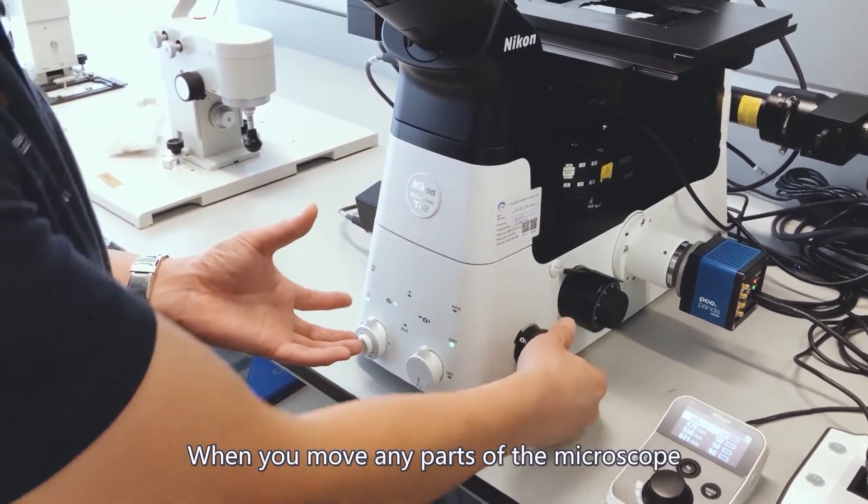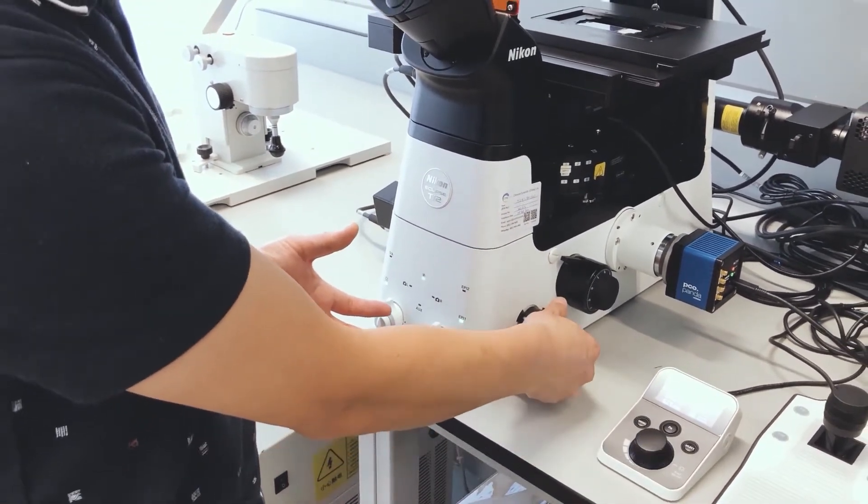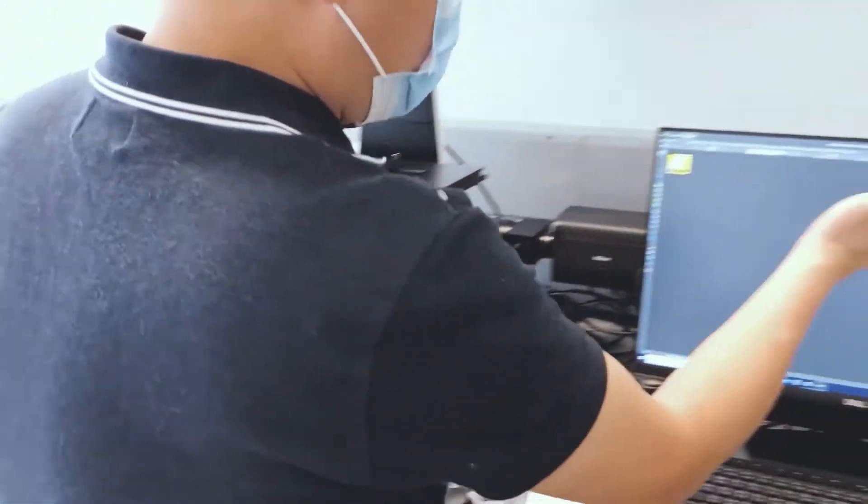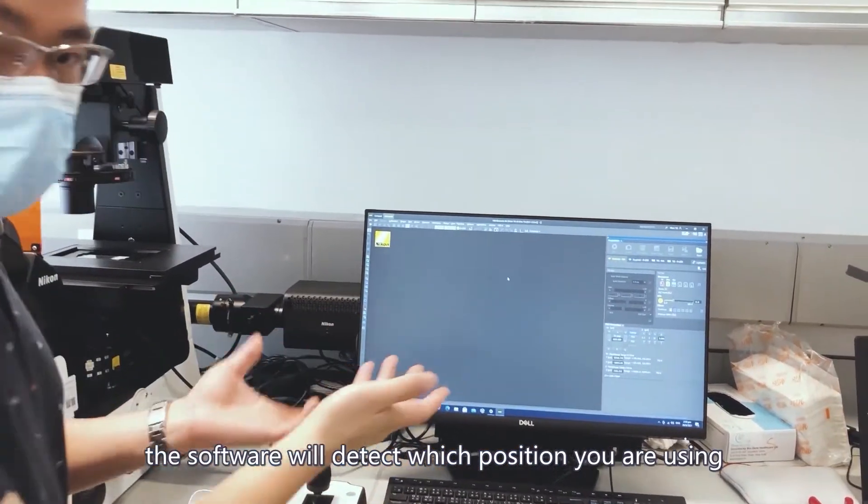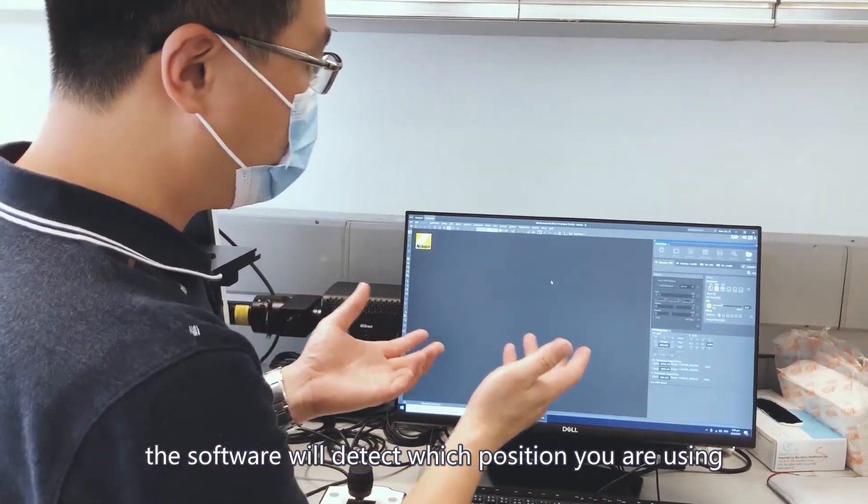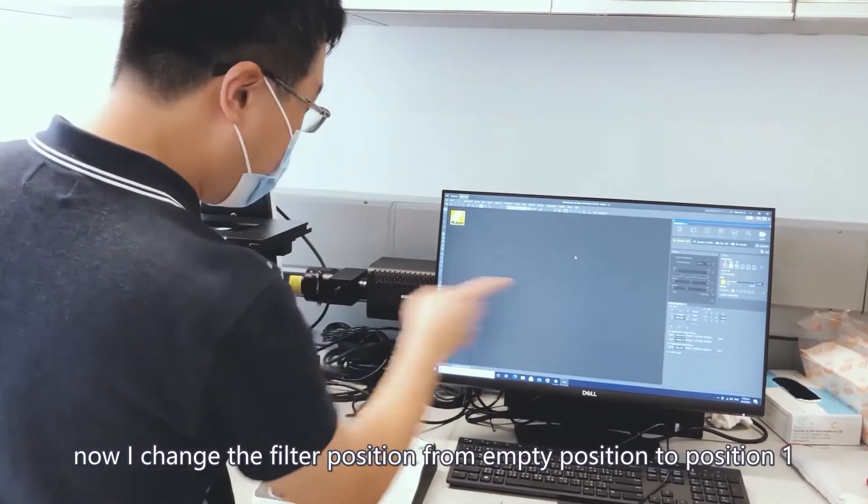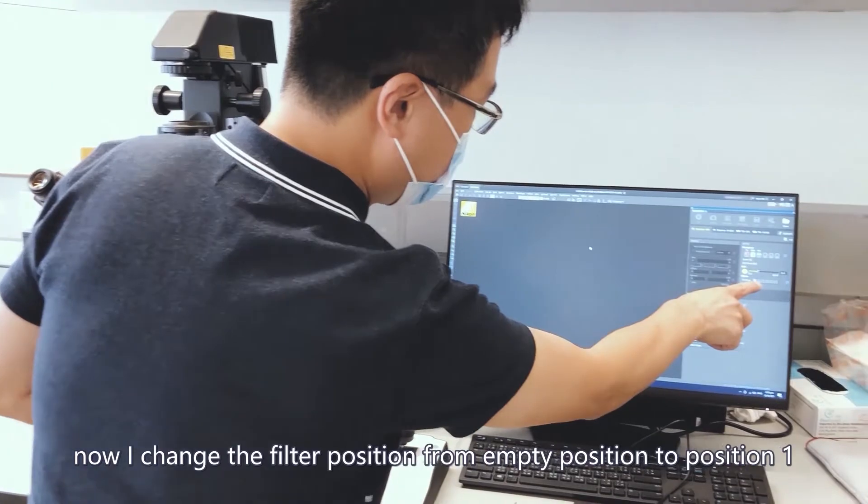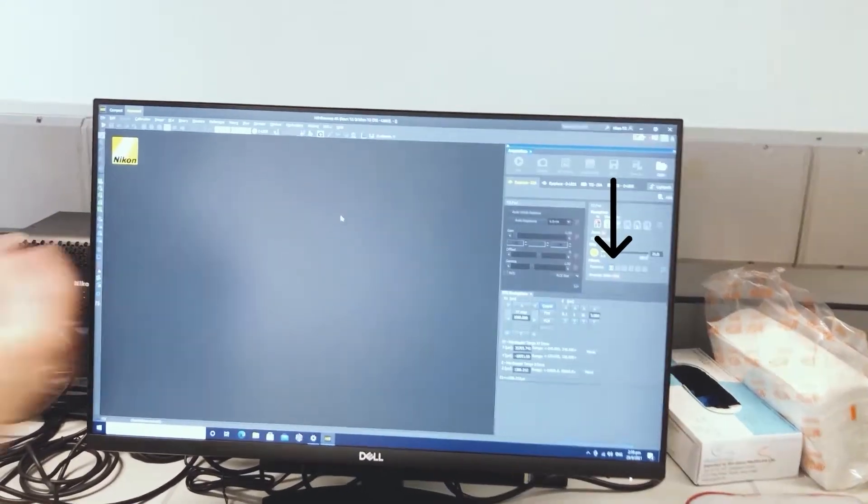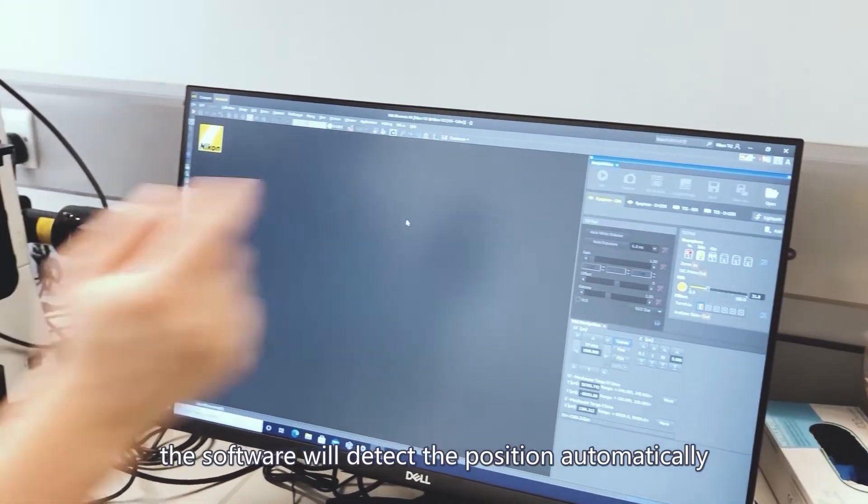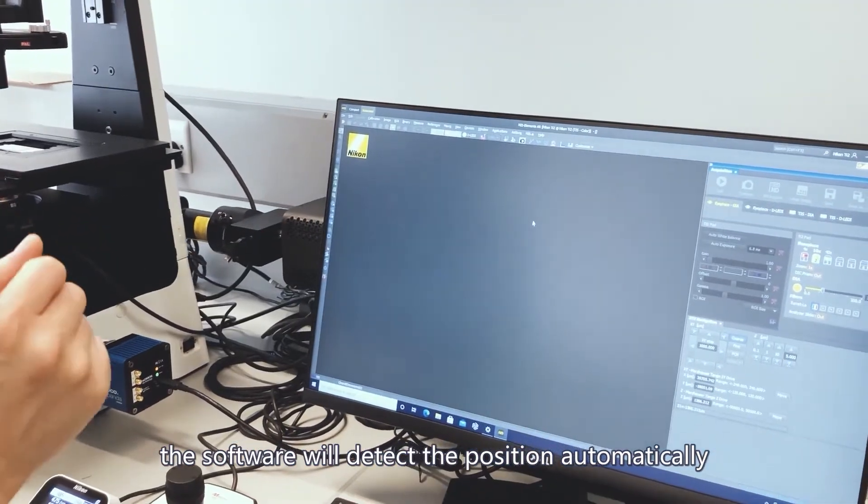But the beautiful thing is, when you move every part of the microscope, the software will detect the position which you are using. For example, now I change the filter position from empty position to filter position 1. The software will detect the position automatically.